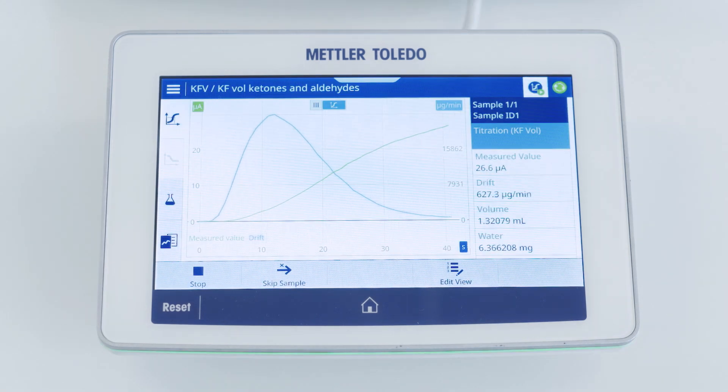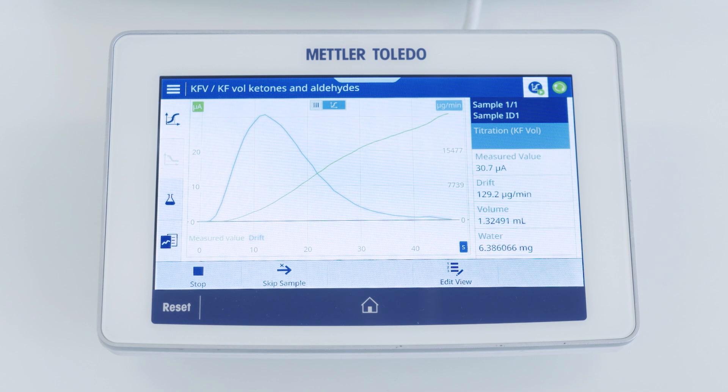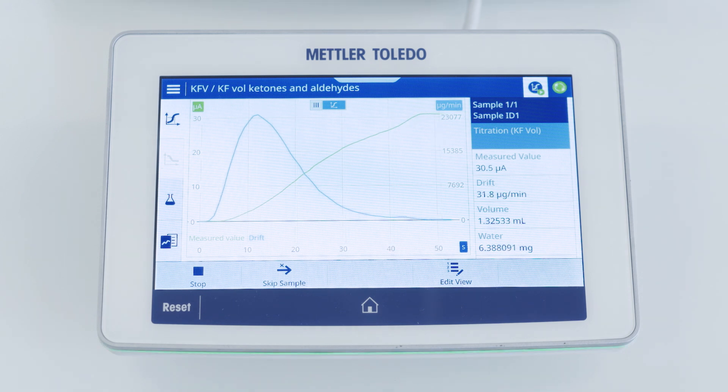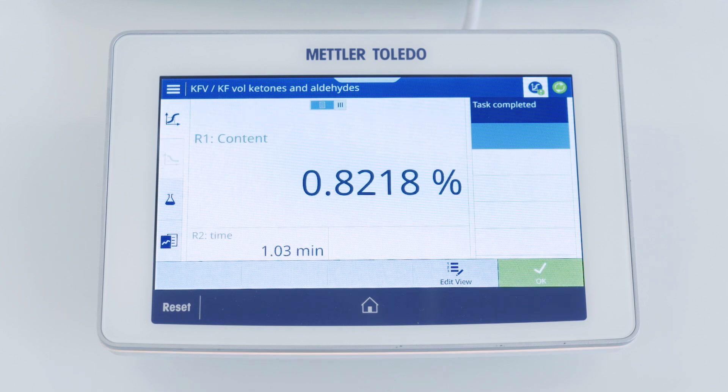Now the sample is being titrated and we can see the drift approaching back to zero and the measured value approaching 30 microamperes which is the endpoint of our titration. And we have our result.